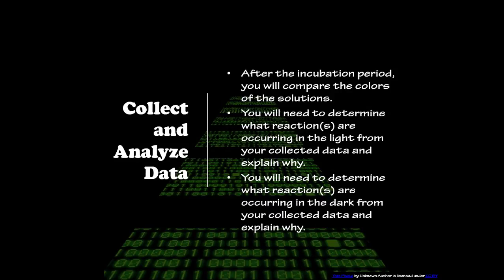After the incubation period, you will compare the colors of the solutions. You will need to determine what reaction or reactions are occurring in the light from your collected data and explain why. You will need to determine what reaction or reactions are occurring in the dark from your collected data and explain why.